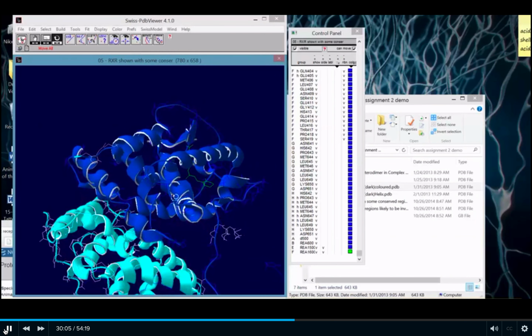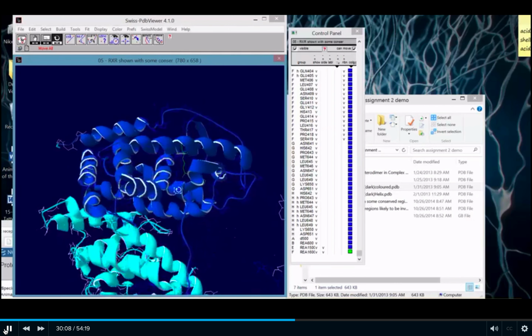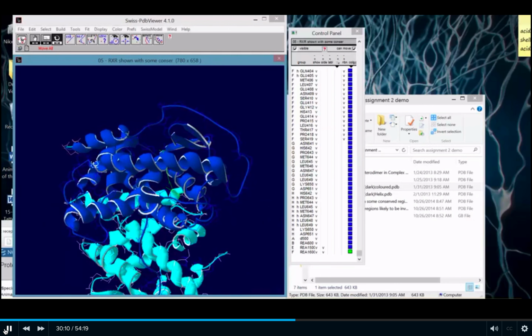I could potentially take a residue over here. I see this loop region here. If you imagine that there's some smaller residues in this region, if I made a bulkier one, that would help to pinch this turn tighter. Actually, it might be easier to say here, right? These were all very flexible glycines. I could put a string of tryptophans on this side, and that would promote this region to turn more tightly. So instead of being a very gentle arc, it'd be a very sharp arc.